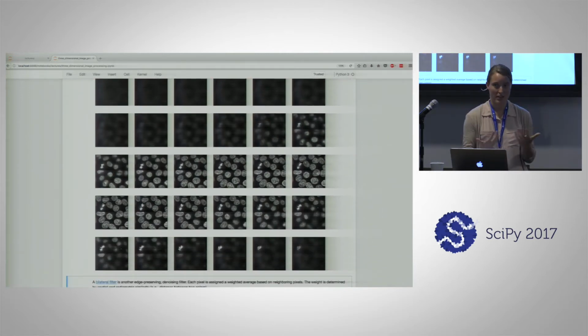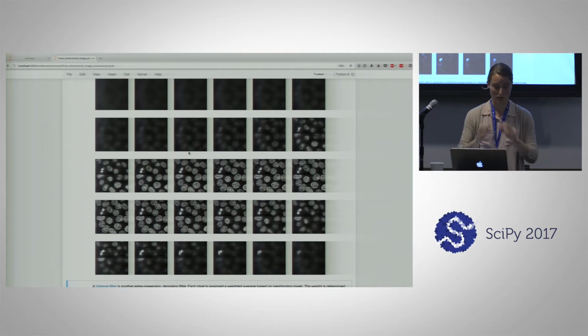So we still have these nice crisp boundaries between our foreground and our background. It's hard to see in this full plane view, but in just 2 cells, we'll see a side-by-side comparison. You'll be able to observe the reduced noise that occurs in the central planes between the cells.